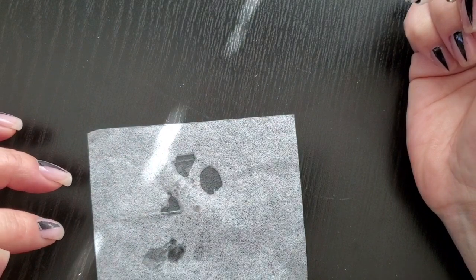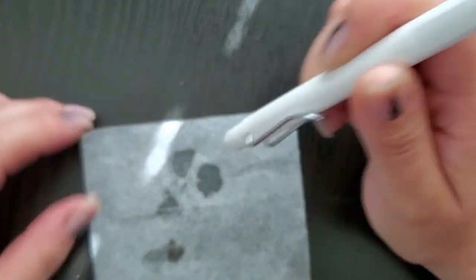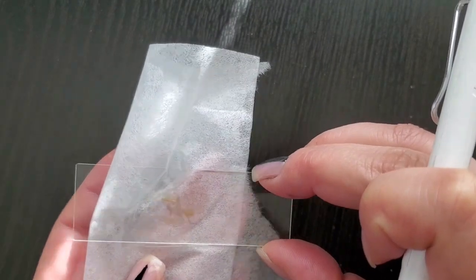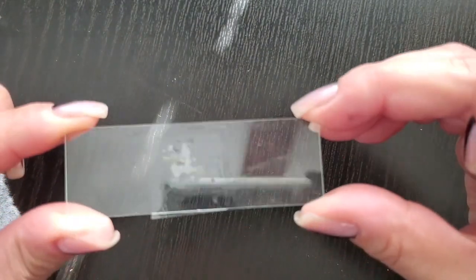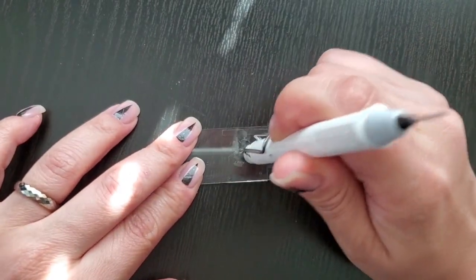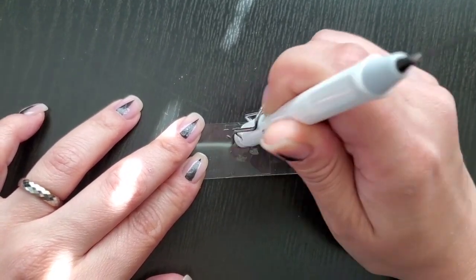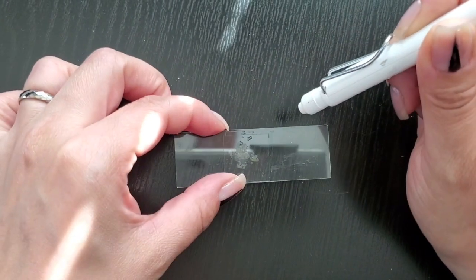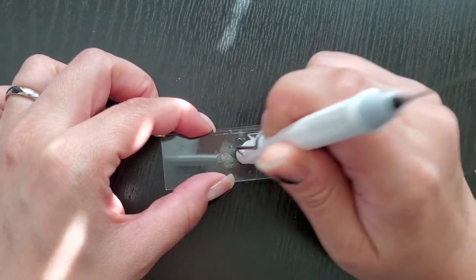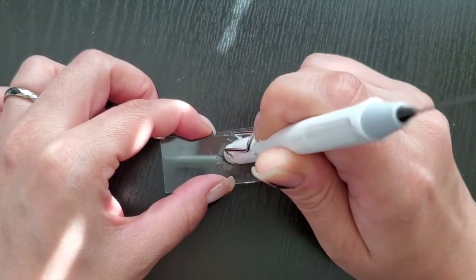You can see the water is coming out from the slide. Now this would have flattened out a lot, but it doesn't seem flat enough. So I just keep going. Sometimes you can just hold the glass down until you've basically destroyed what you see.